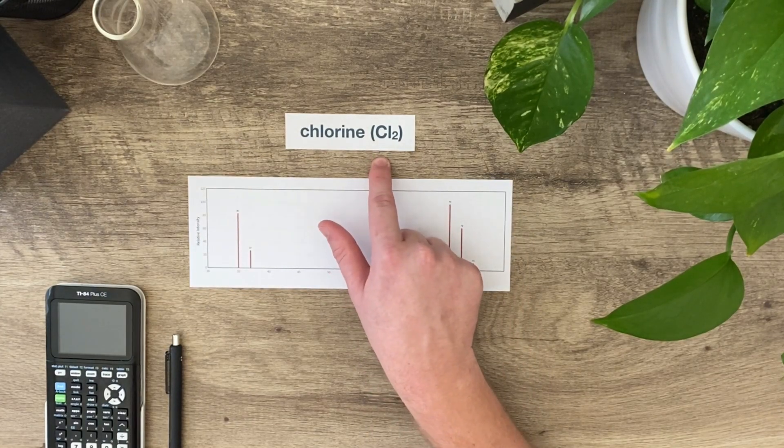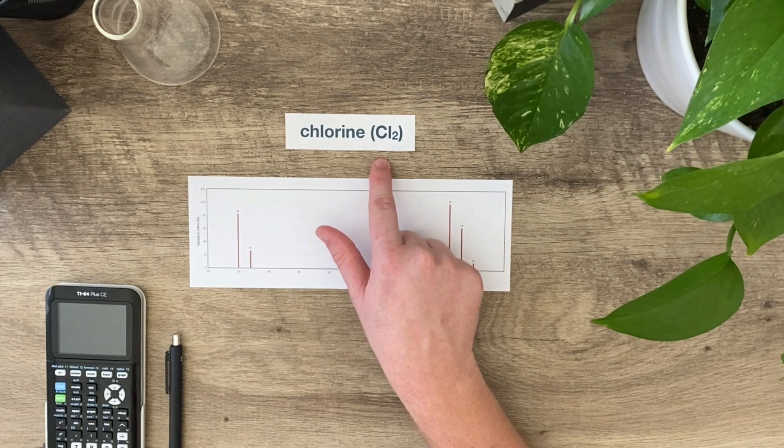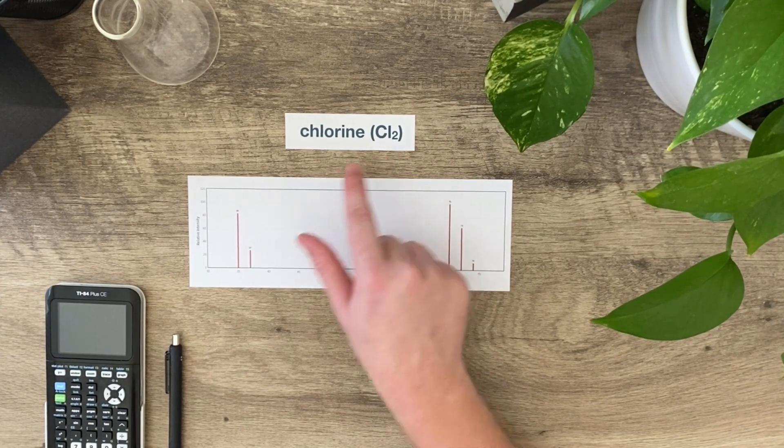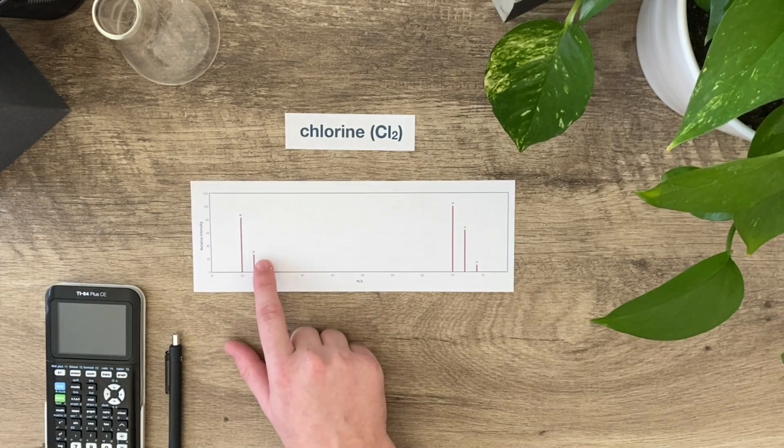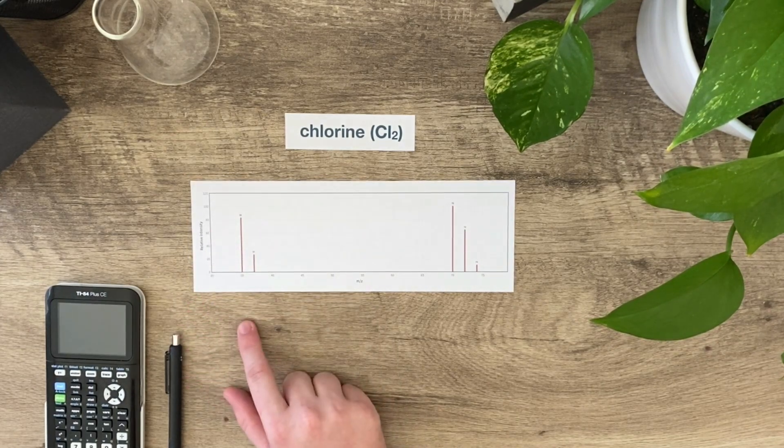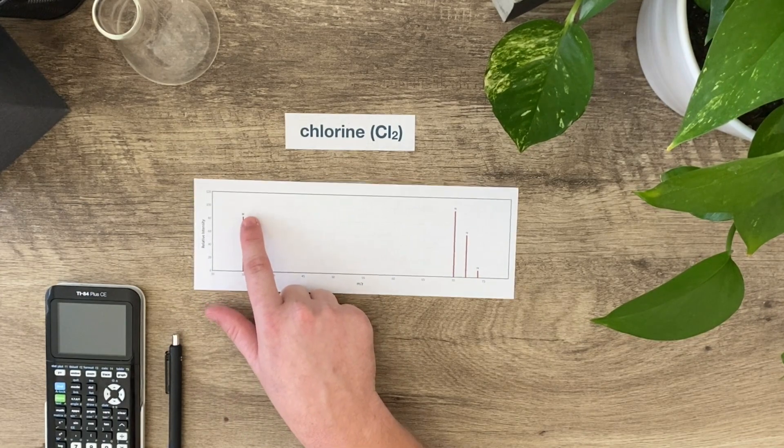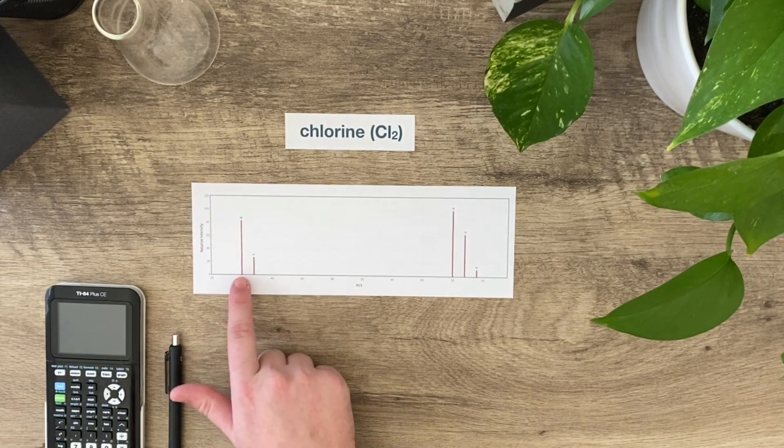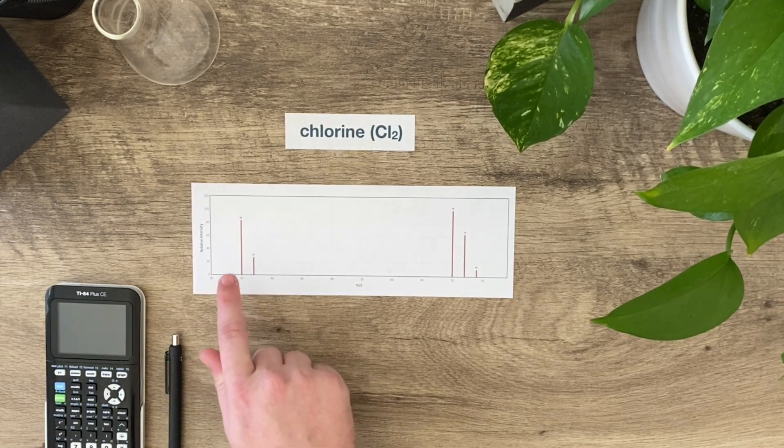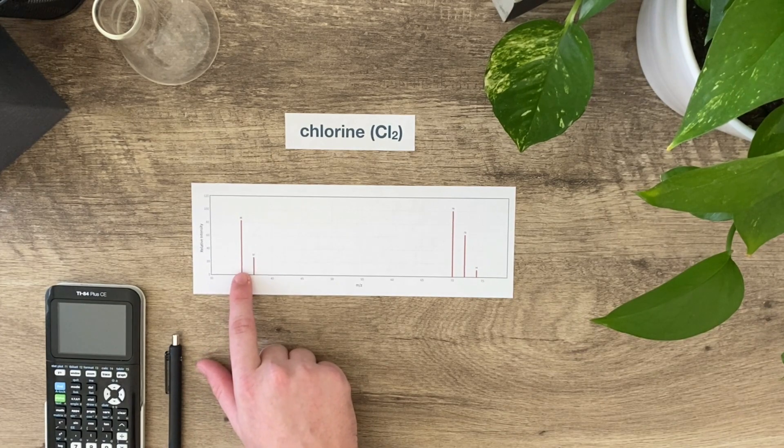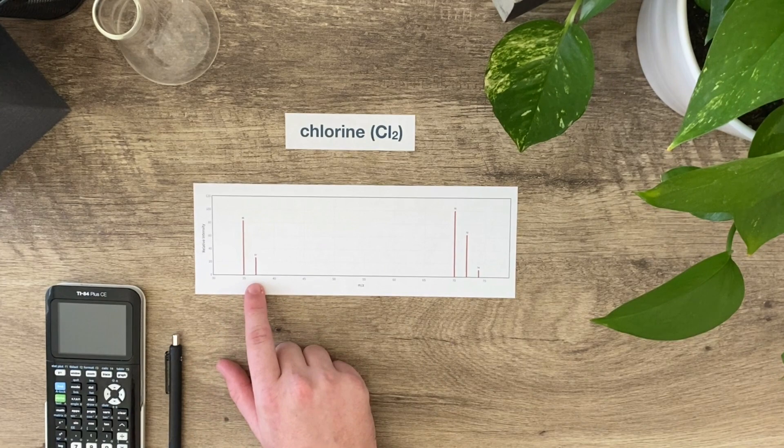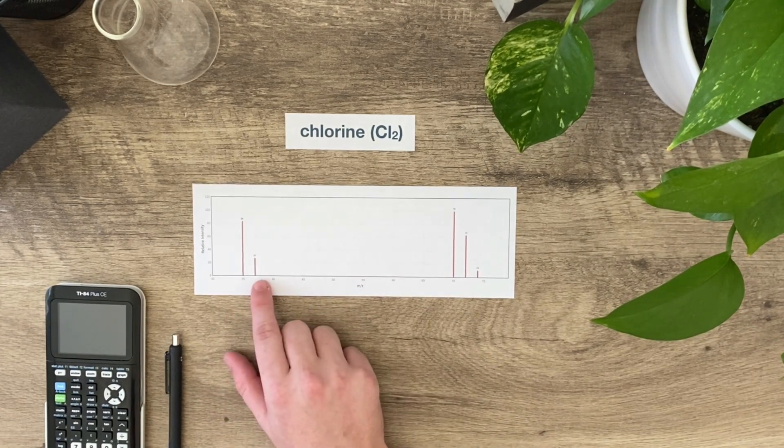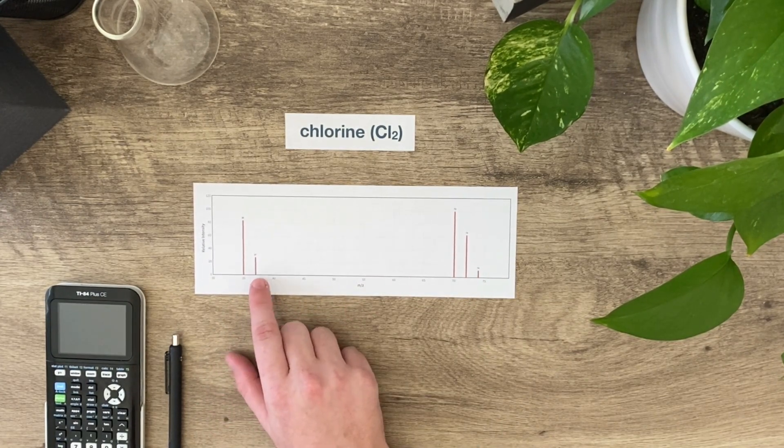The average atomic mass of chlorine is 35.5 because some chlorines have a mass of 35 and some chlorines have a mass of 37. This is associated with abundance. 35 is at roughly 80% intensity, so if I have a sample of chlorine, it's going to be a majority Cl-35. If I have a mass of chlorine, some of it is going to also have a mass of 37, and that's where these peaks are coming from.